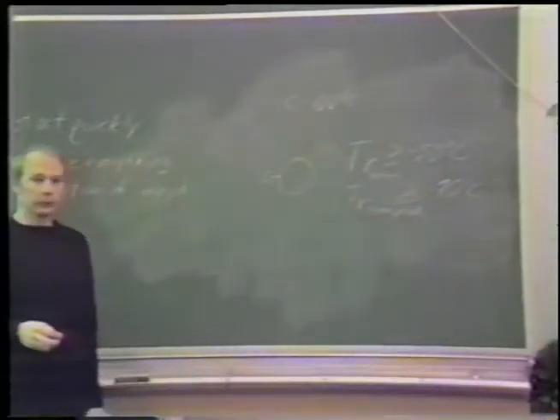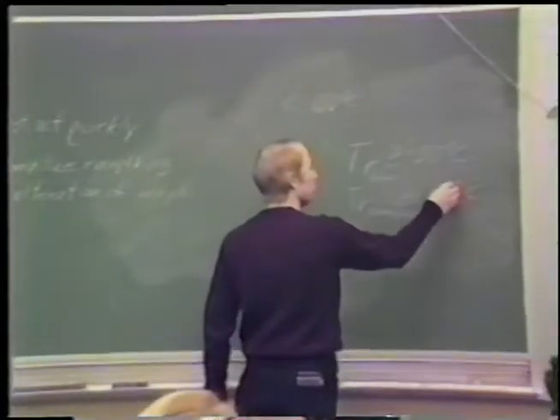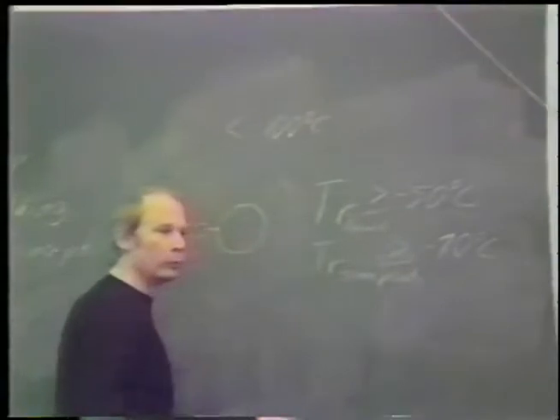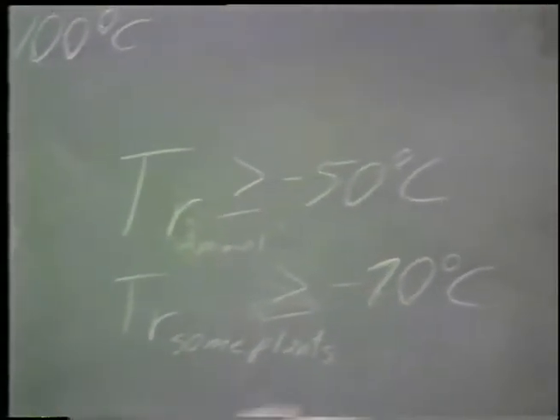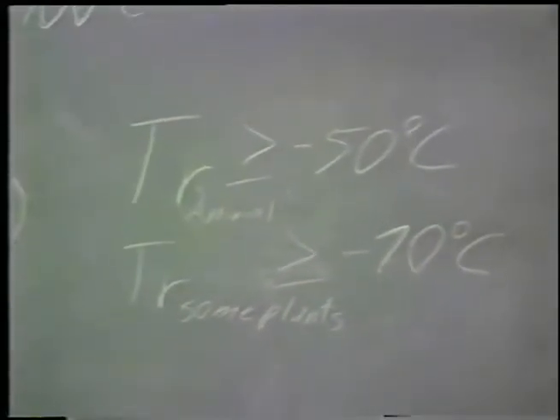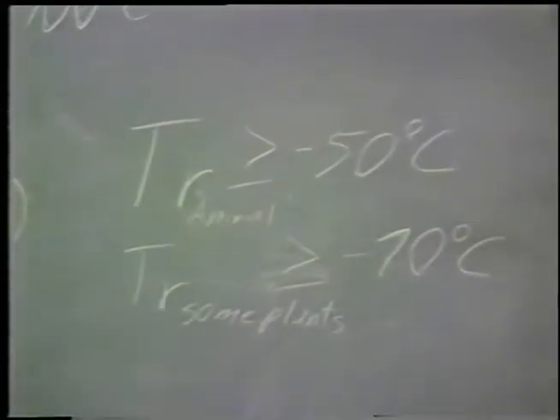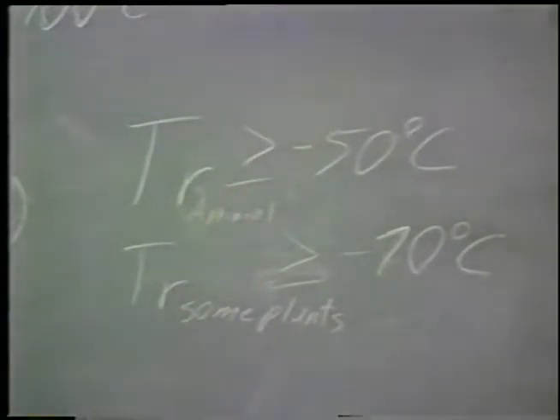There are some systems you have to be more careful with than others. Most systems, this is fine, but if your sample contains natural cryoprotectants, which you can get a clue for when you look at the quality of freezing in relatively thick samples, then you want to avoid getting it above minus 70. And these figures were determined largely through one electron microscopical study.